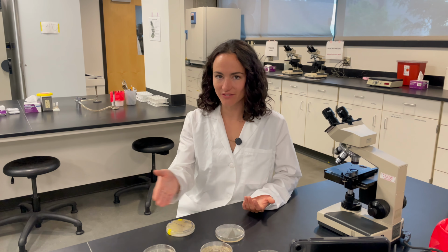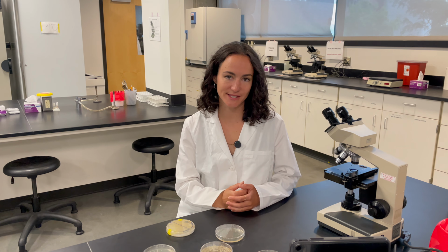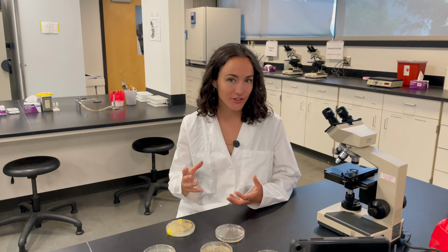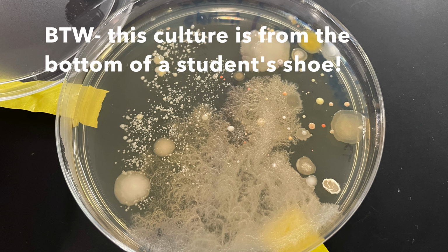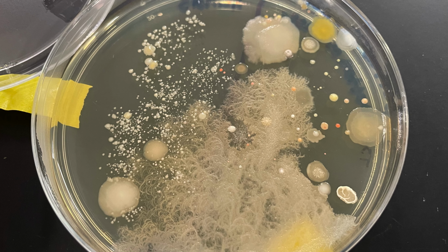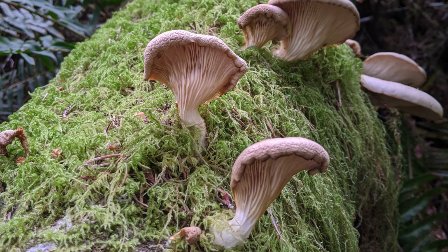So did we find any of them on our sampling plates? Well, if you see any fuzzy growth or filamentous growth, that's a telltale sign that you're looking at a fungi. Fungi can definitely be macroscopic. But maybe what not everybody knows is that fungi can also be microscopic, and they're generally divided into two categories. We have the yeasts and the molds. Molds are the fuzzy ones.